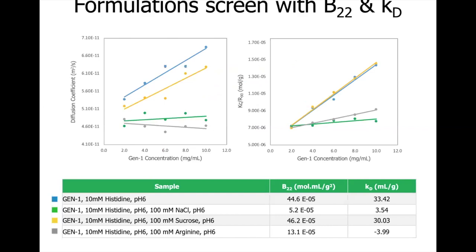In these graphs we have B22 and Kd data for a monoclonal antibody in four formulations: histidine buffer with no excipient, and with sodium chloride, sucrose, and arginine. In the Kd data, histidine buffer and histidine buffer with sucrose give positive slopes and the highest Kd values, showing the strongest repulsive interactions. Arginine buffer gives a negative slope, indicating attractive interactions and a propensity for self-association, resulting in the least favourable conditions. The B22 data aligns with the Kd data — sucrose and no-excipient conditions result in steep positive slopes and highest B22 values indicating repulsive protein-protein interactions.